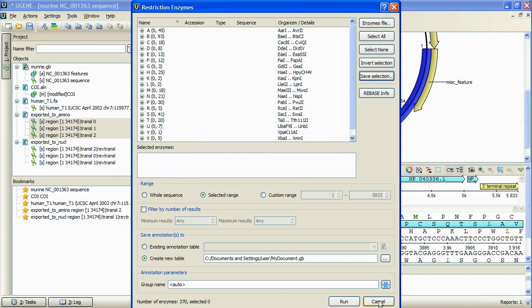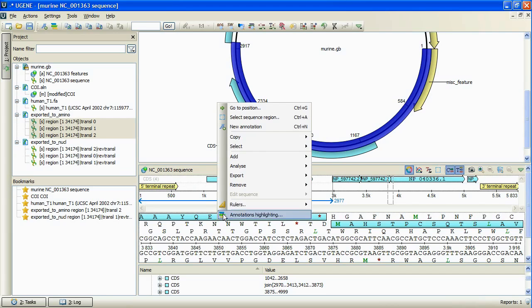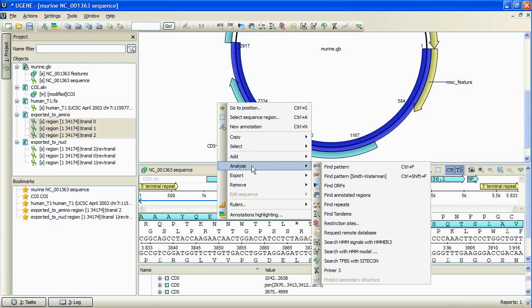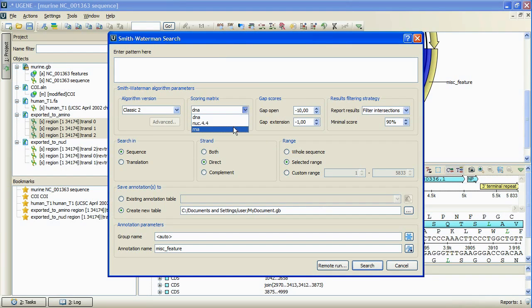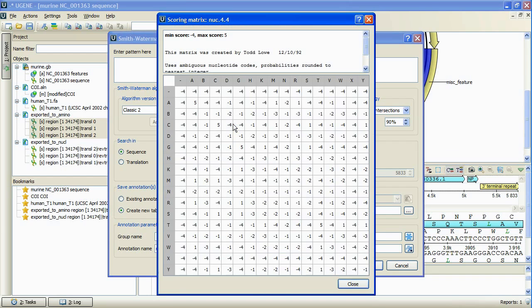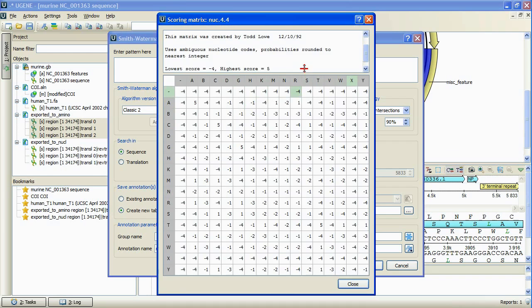Speaking of the sequence analysis, we should mention Smith-Waterman plugin changes. There are two new scoring matrices to perform search in a nucleotide sequence, and a lot of new matrices to perform the search in an amino acid sequence. Also, every matrix is now supplemented with detailed information.